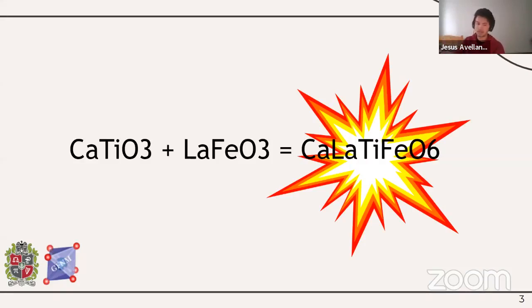First of all, initial calculation using the SPuDS software showed us that we had a high enough tolerance factor, around 0.95, for two specific structures. Thus, this sample could be synthesized using the so-called simple solid state reaction method, which is why this little work began. Also, around that time, Professor Roa suggested that we might be coming across a material that had different valence bands for each spin direction. And taking into account the recent boom in spintronic materials related research, it was worth giving this a try.